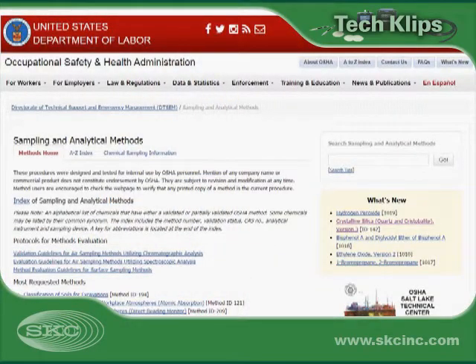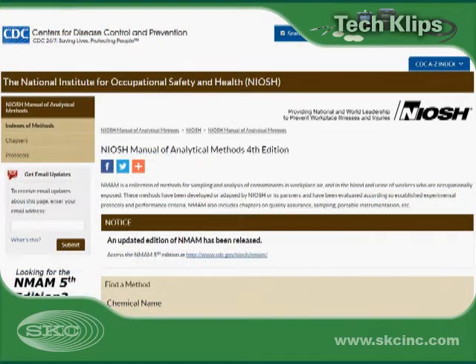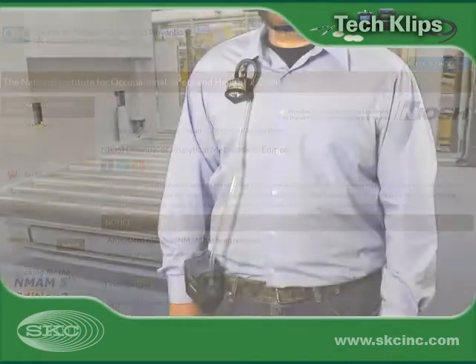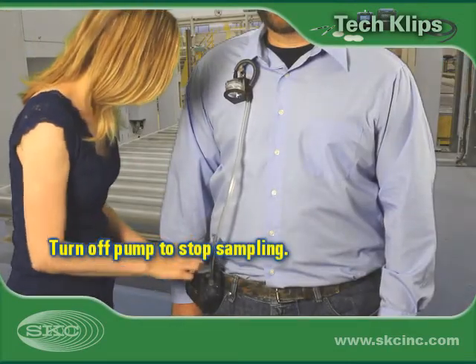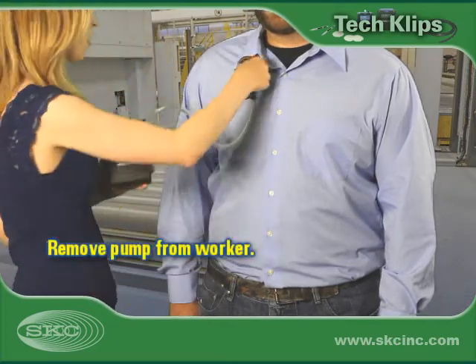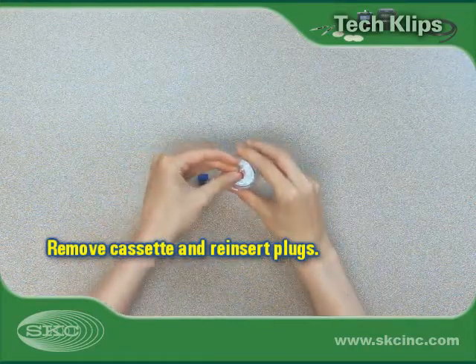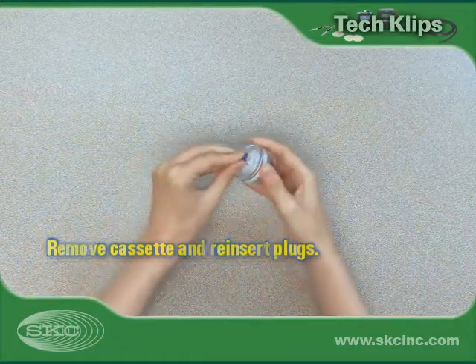Sample for the length of the work task or shift to meet requirements. Sampling times may be limited due to analytical reasons, so be sure to check your method. Stop sampling by turning off the pump. Remove the sampling train from the worker. Remove the filter cassette from the holder and reinsert the inlet and outlet plugs.